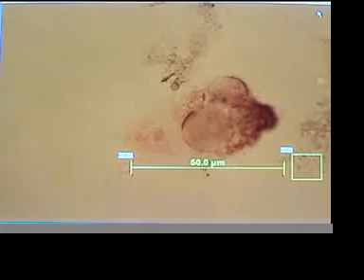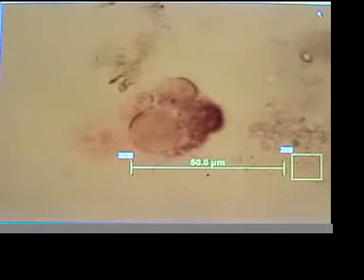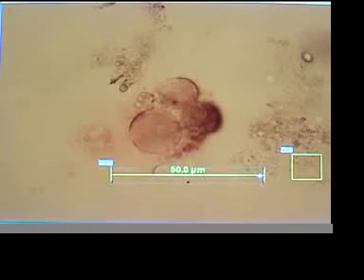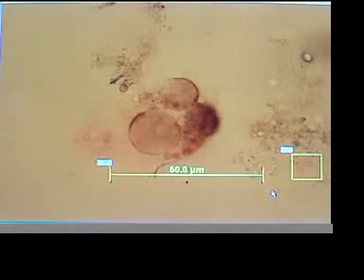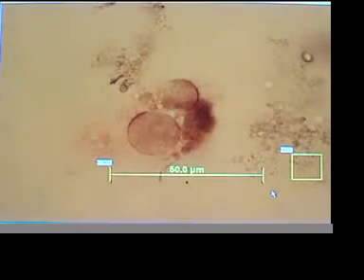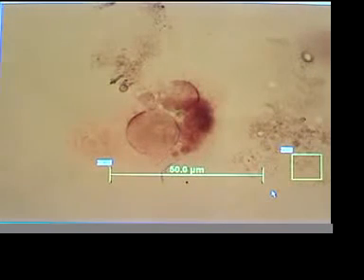Now I'm going to move it and center it a little bit. Okay. Let's watch it for a moment. The aftermath. And the scale is correct. You can see that some kind of action continues after the devitalization.